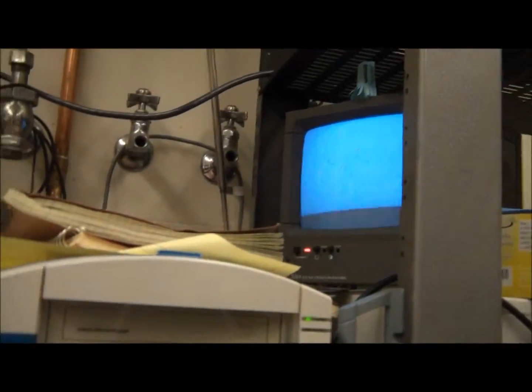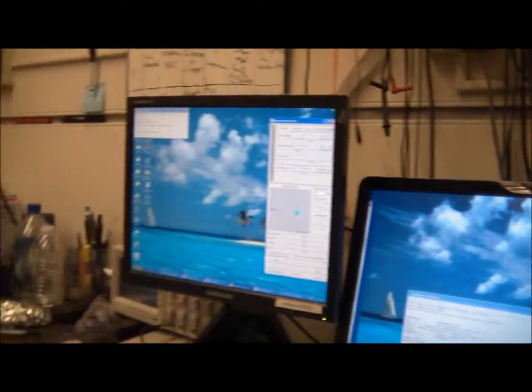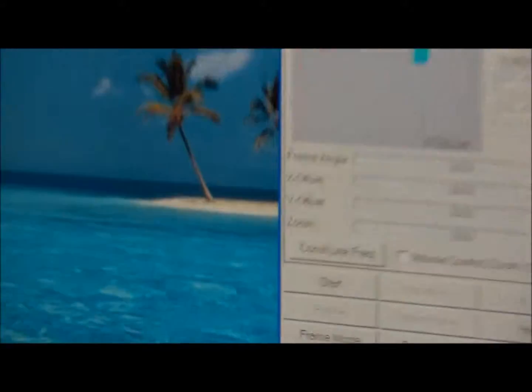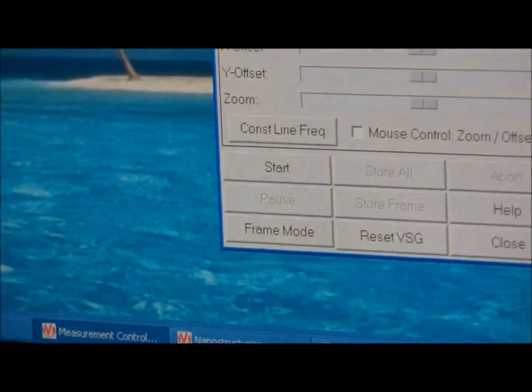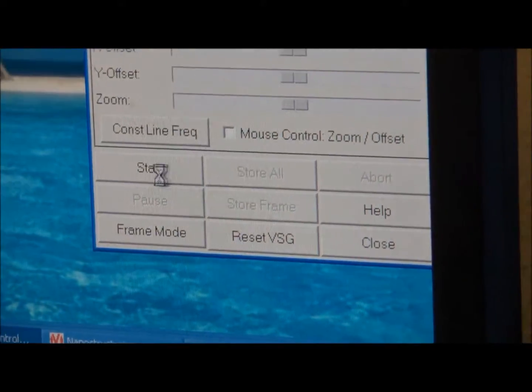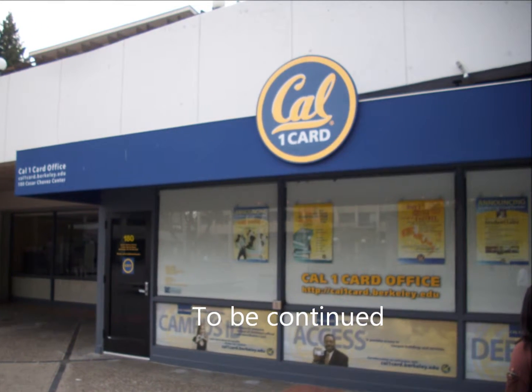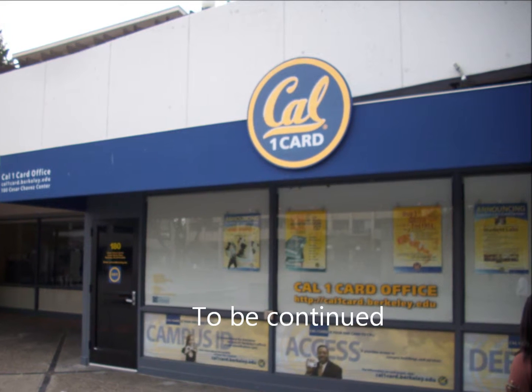The image goes away because there's no light. Then I'm going to start the program by pressing — where's the mouse? By pressing.